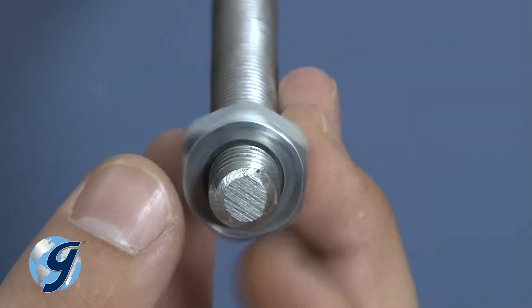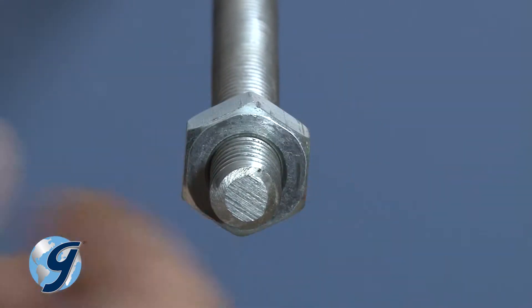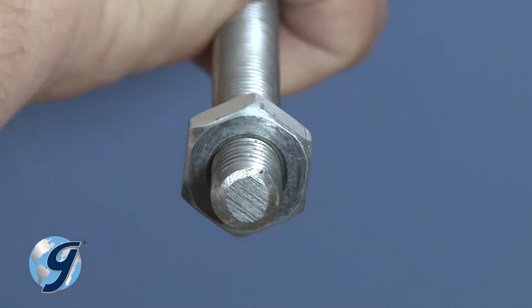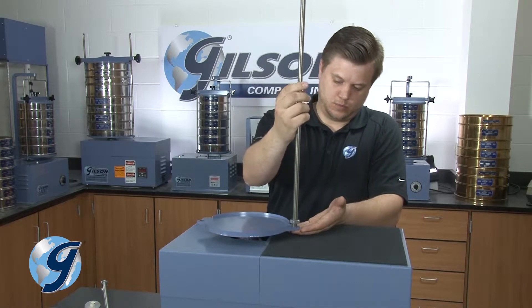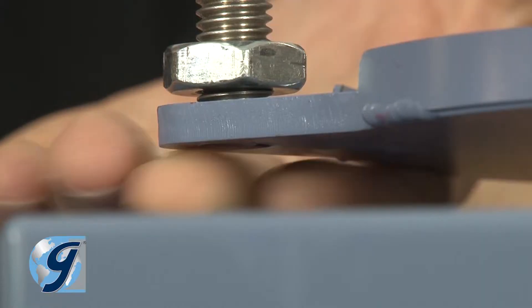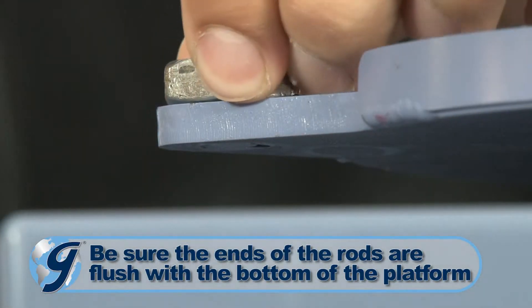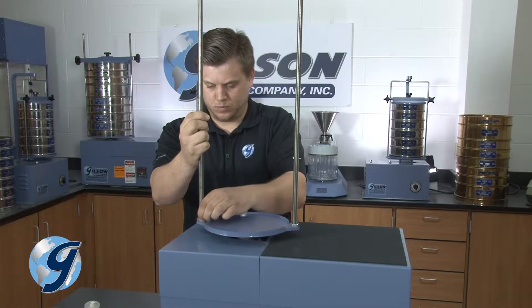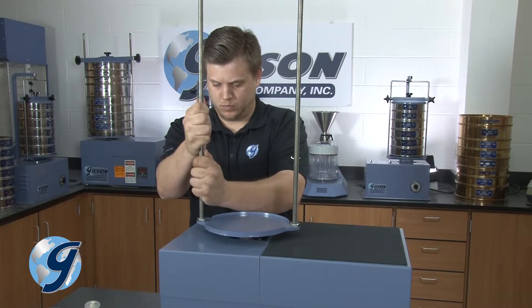Take the new full threaded rods and screw the jam nuts on about one half inch from the ends. Next, thread the rods into the platform making sure the ends of the rods are flush with the bottom of the platform. Secure the rods to the platform by tightening the jam nuts.